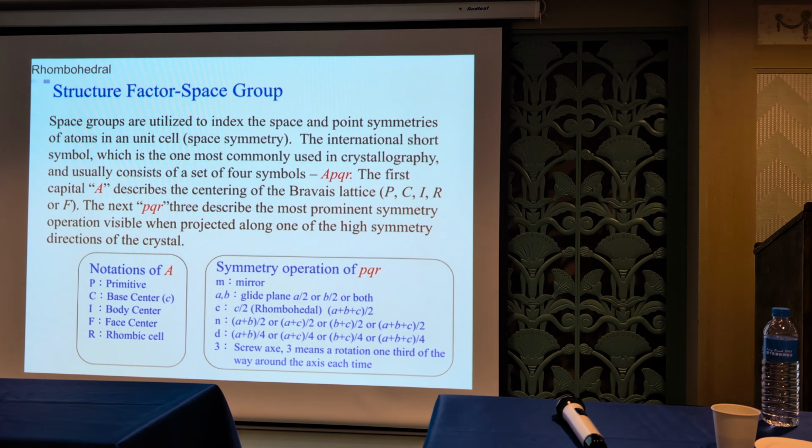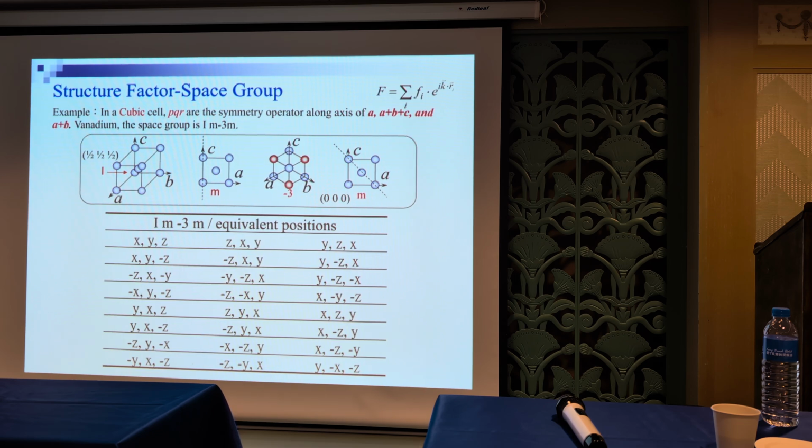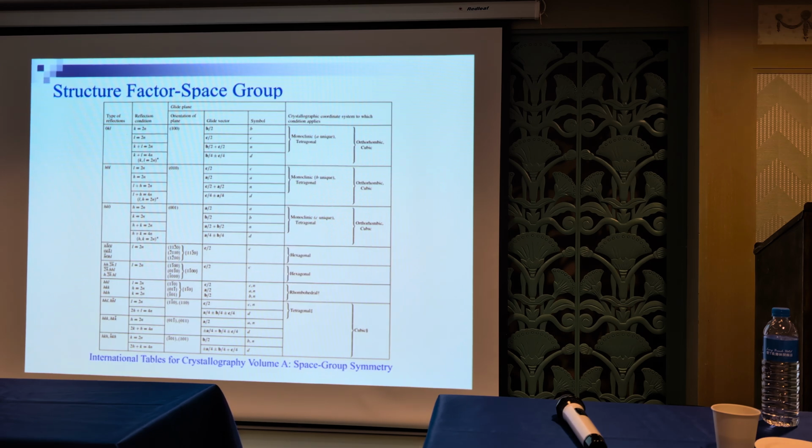But for the details, please go to learning solid state physics. Okay, ignore this one. And here it tells you which kind of space group will give you a corresponding diffraction peak.